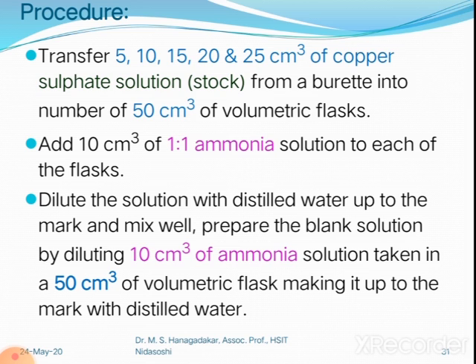Then, third step, dilute the solution with distilled water up to the mark and mix well. This is for the preparation of the 5 standard solutions.